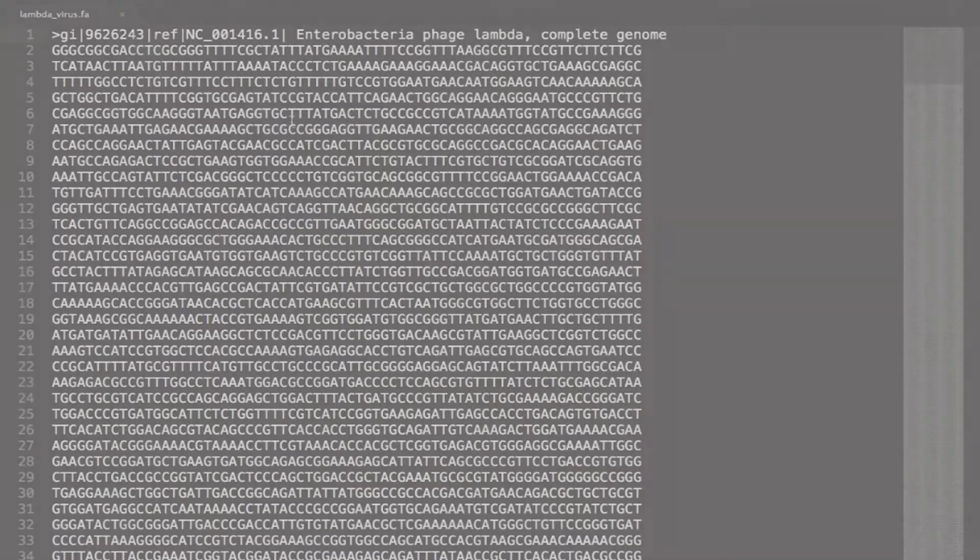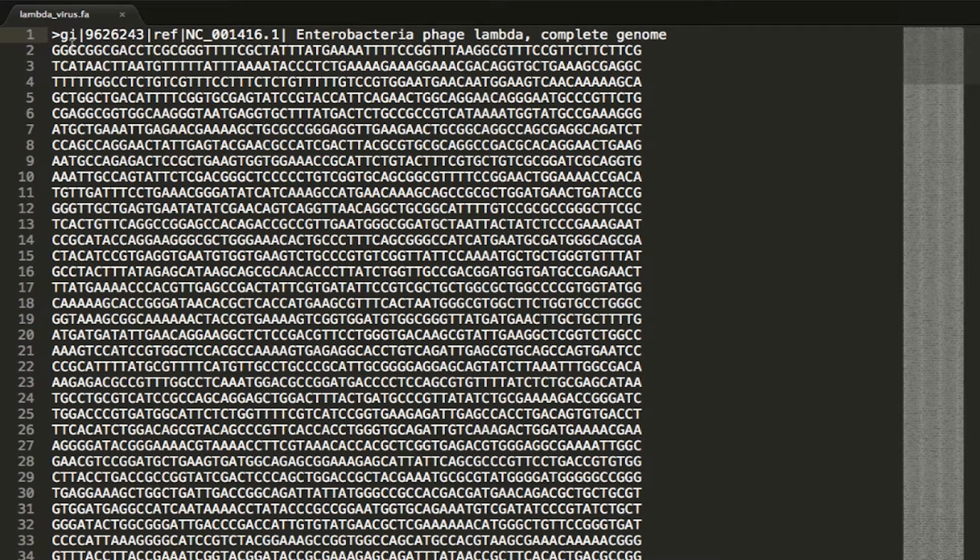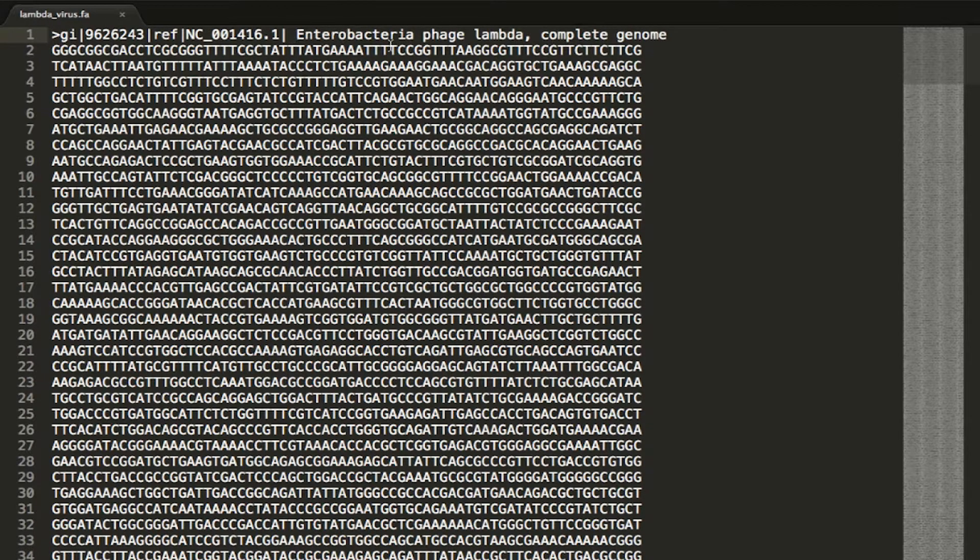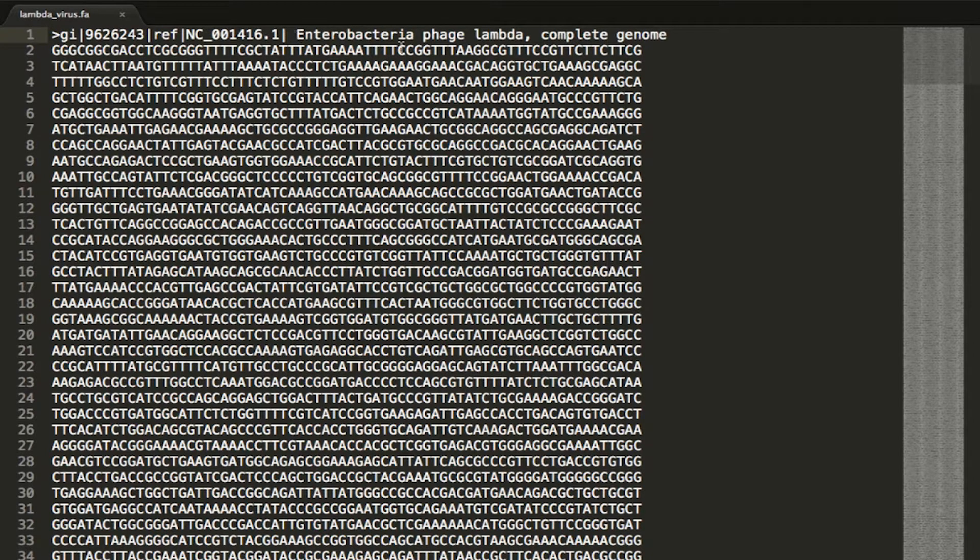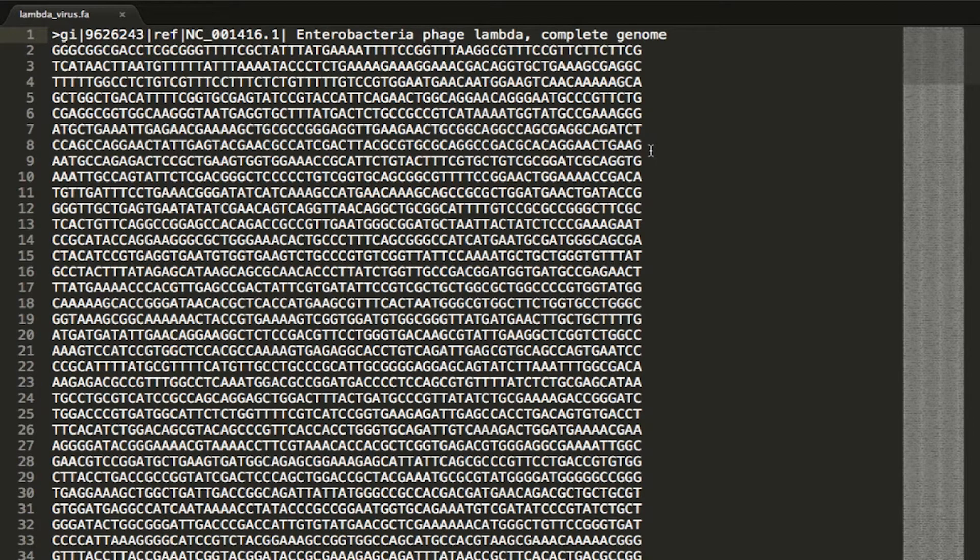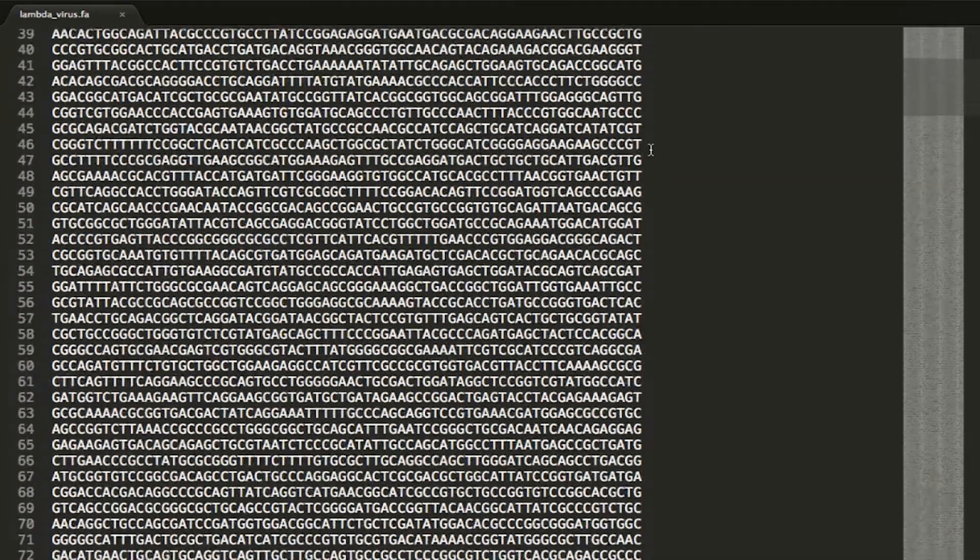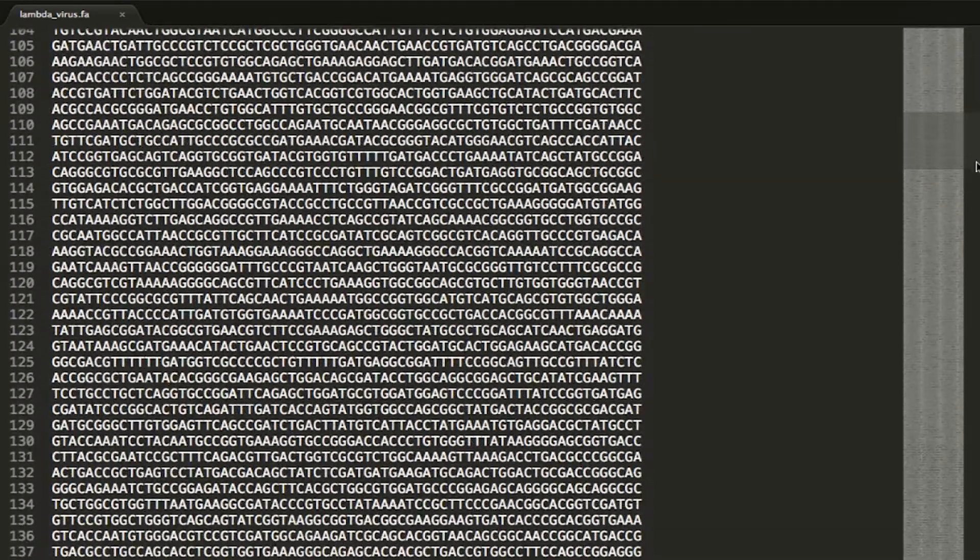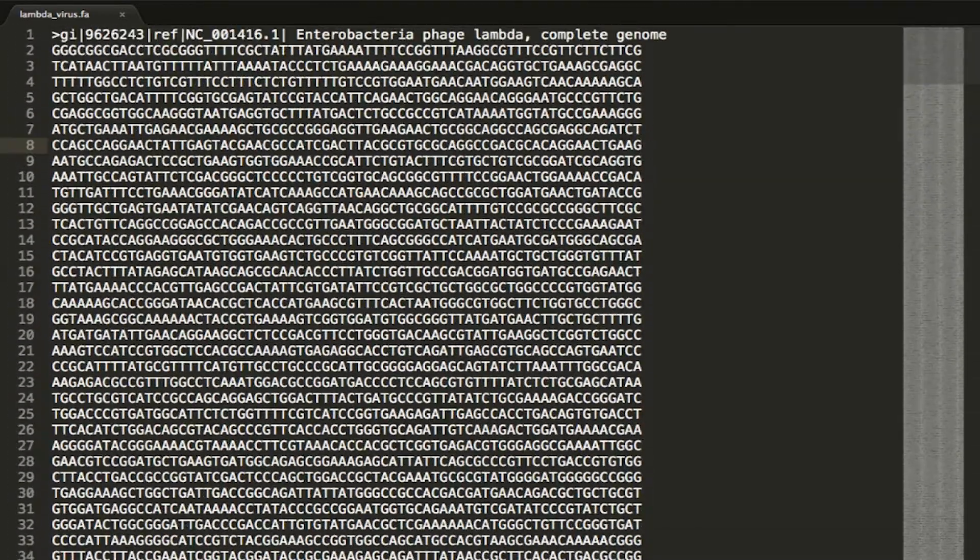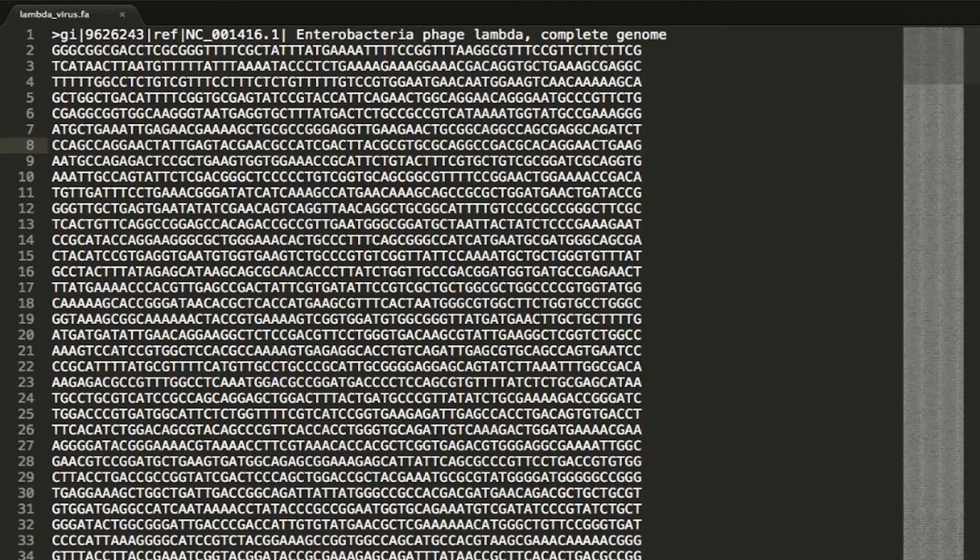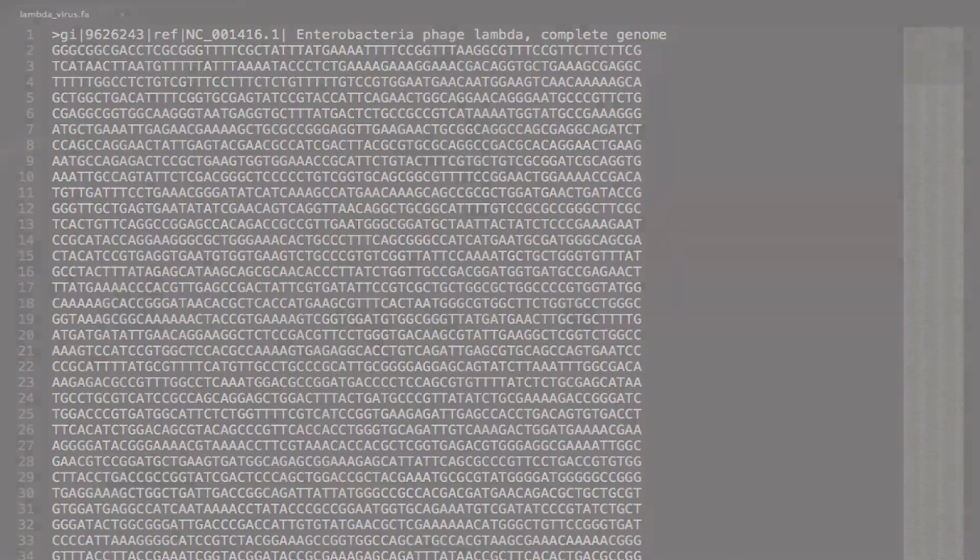If you download this into your Python directory and open it up, you should see a file that looks something like this. You'll notice the first line starts with a forward arrow and then has a lot of identifying information including the name of the organism, which is the Enterobacteria phage lambda. And then following that is just a lot of bases. There are strings of like 70 bases and just a whole file full of them. And this is the entire genome for this organism.